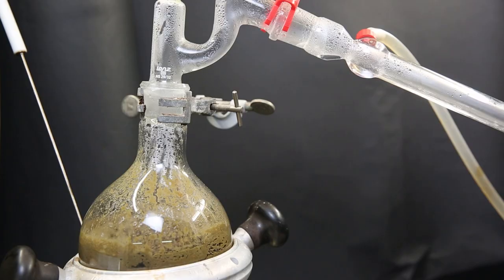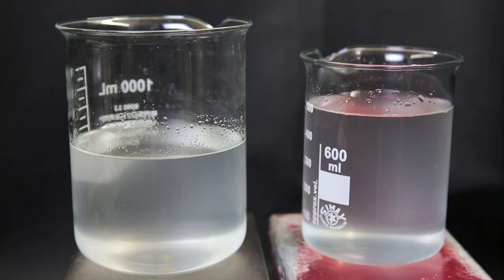After a while, the mixture started to boil. And I kept adding water until I collected about 1 liter of distillate. Now, this distillate should contain some essential oil. Since it is quite a large volume, it won't separate out easily. So to get it out, I can extract it with some hexane.